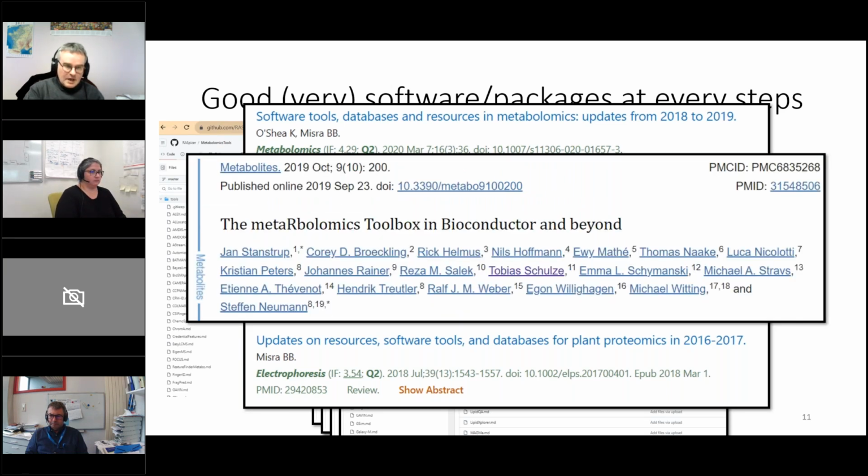And we have also another repository, and I love the Metabolomics Toolbox. That is a GitHub page where lots of tools are described and categorized for every step of the metabolomic process. And in that metabolomic workflow, we have that annotation step, and a lot of tools are really finely described and are accessible at just a click.